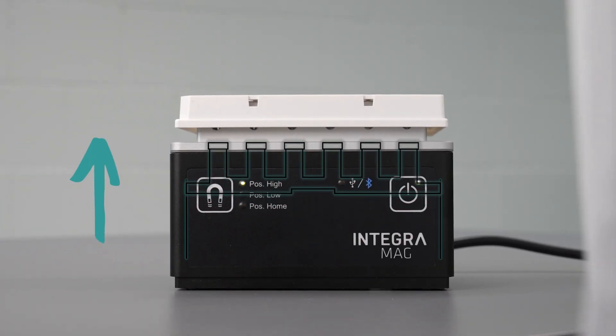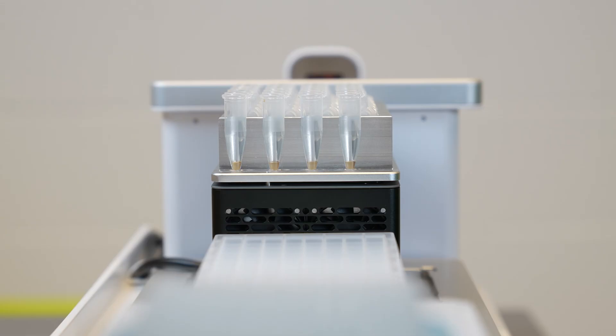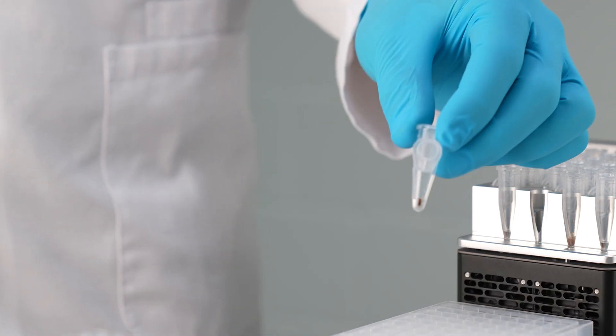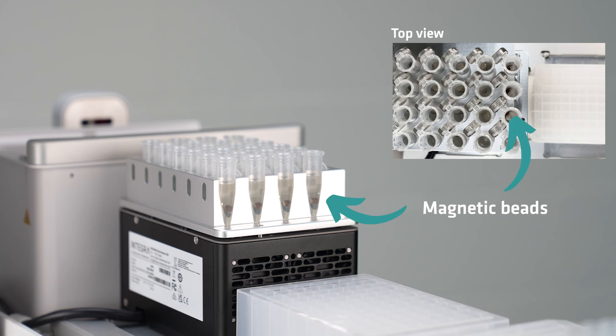Instead of moving the labware onto a magnet, the Mag Modules offer vertical magnet movement, saving space and preventing spillages. The magnet height is fully adjustable according to volume, and the powerful magnets provide ideal conditions for bead collection, guaranteeing minimal bead loss for high yields and optimal purity.